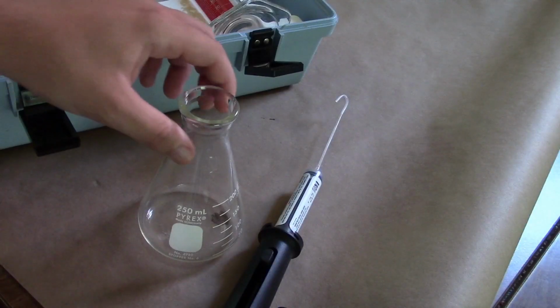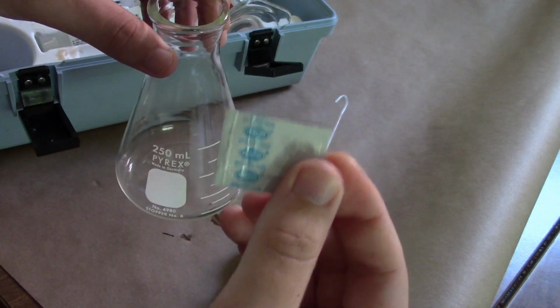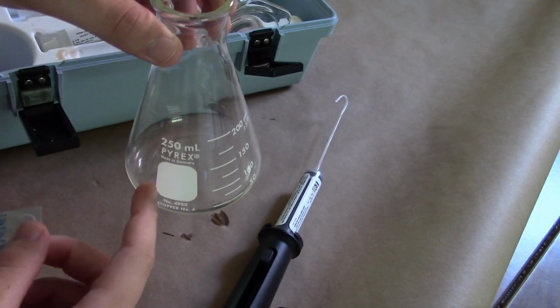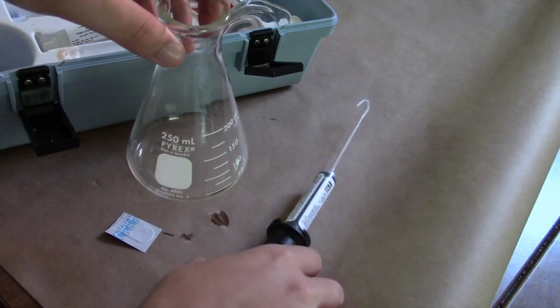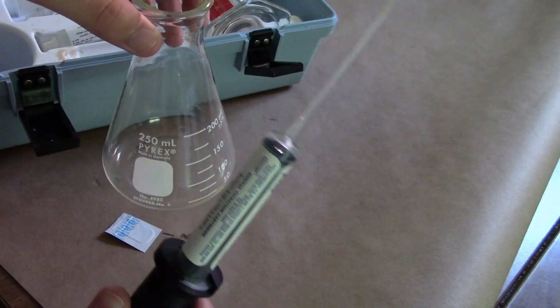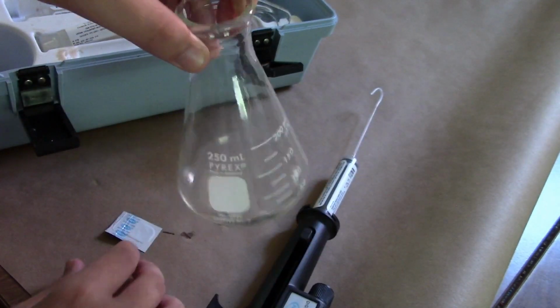So the final thing to do would be to add in our indicator to a 100 milliliter sample and swirl it until we get an even green tint. Then we would perform a titration using the sulfuric acid, going until the solution turns and remains a reddish pink. So let's head over to the creek to see this in action.